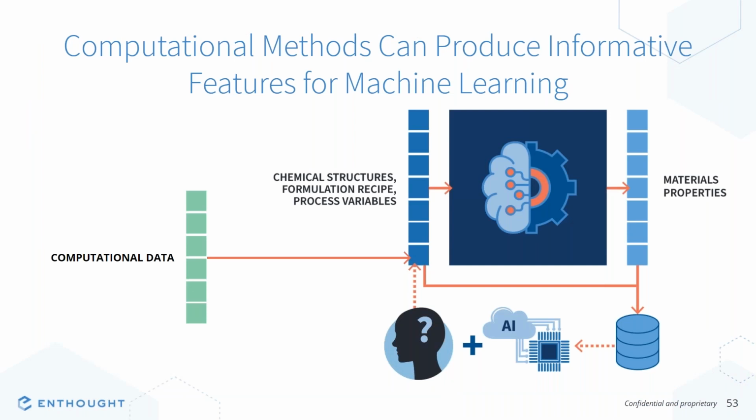An additional place is to start looking for new sources of data. For example, many labs have computational groups, but oftentimes these groups are maybe disconnected or disjointed. How do we bring computational data into this, where these are acting as new features for our predictive models? So even before we get started in the lab, what are some common series of computational methods we could apply to provide us with information and knowledge that helps us make more accurate predictions about what to do when it comes time to make things experimentally?